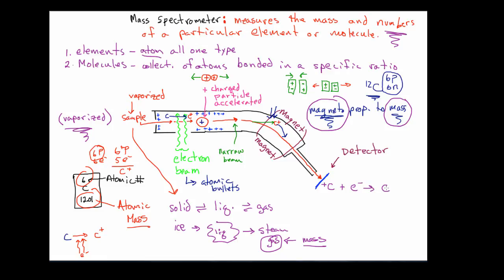The thing that you've got to remember about moving electrons: we're going to donate an electron from the plate on the detector to the charged particle to neutralize it. So we're going to give an electron back to the particle. Now here's the catch to this.